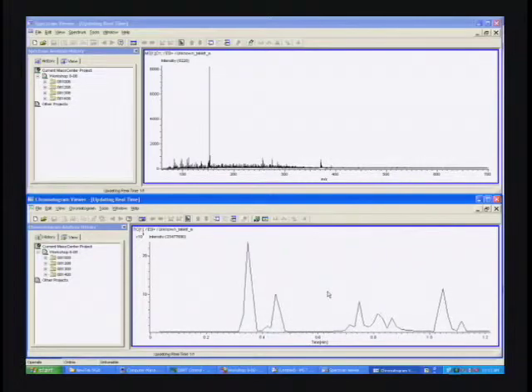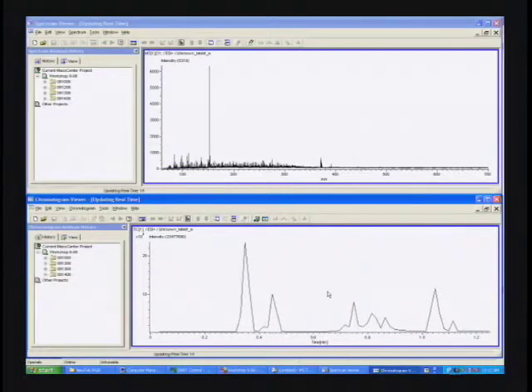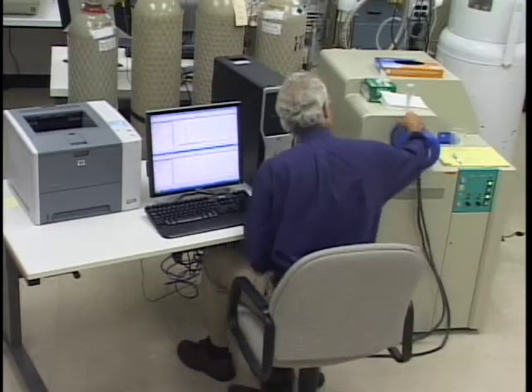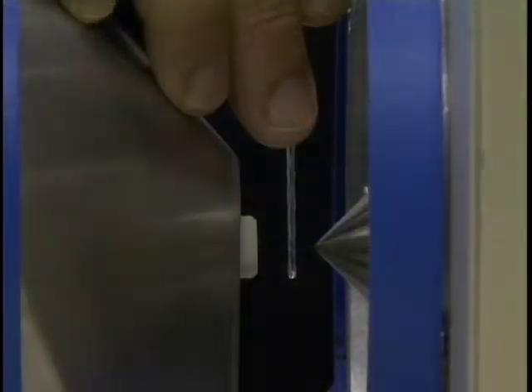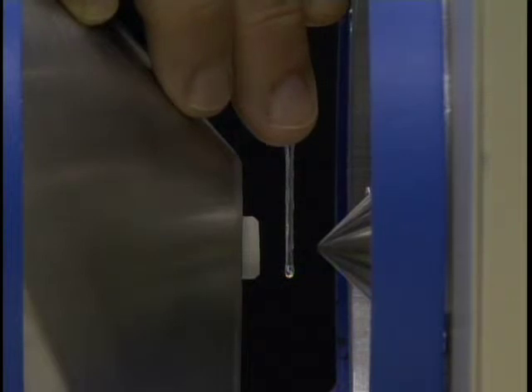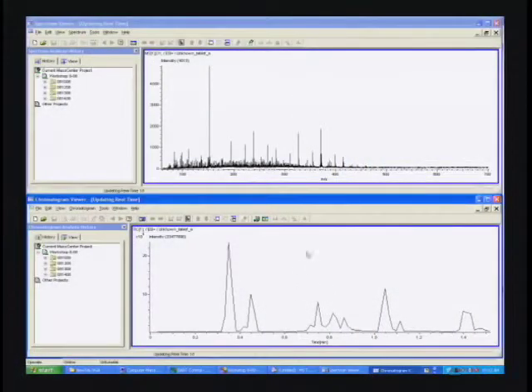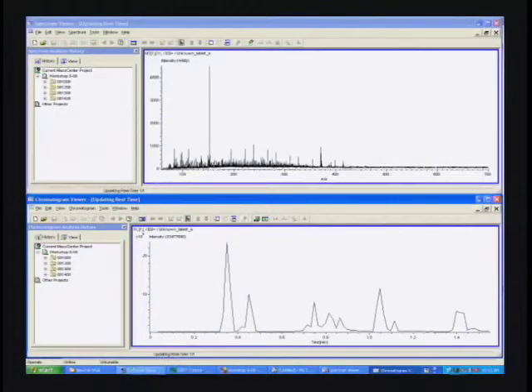Now we'll go ahead and set that down, and we'll pick up some polyethylene glycol on a melting point tube. This is undiluted polyethylene glycol, and that's just going to show how much contamination we can put in front of the system and still have it recover when we take the sample away. Okay, so that's gone. Now we're done. We're back to baseline levels.